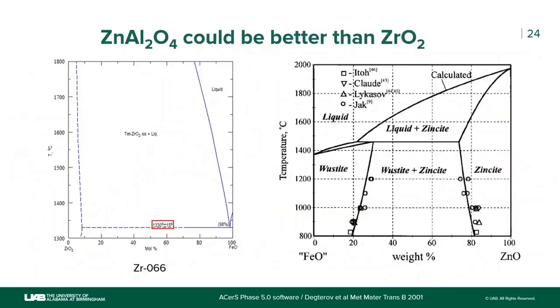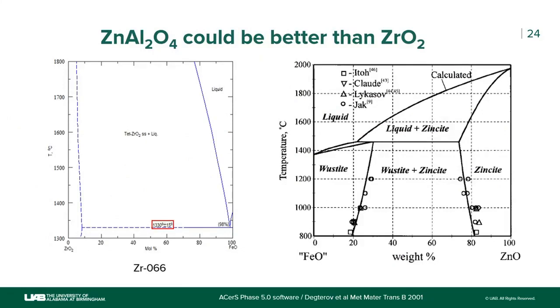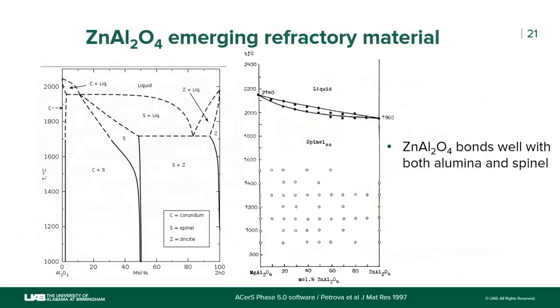Questions? Yes, please. Thanks, it was a very good presentation. Just a quick question. When you're testing raw materials, when you receive them, they have a range of chemistries. So when you're doing the test, let's say you have 98% aluminum compared to 97 or 99. So you have a range. What's the tolerance you have when you're running those tests?